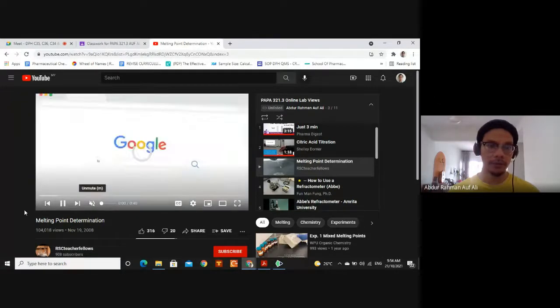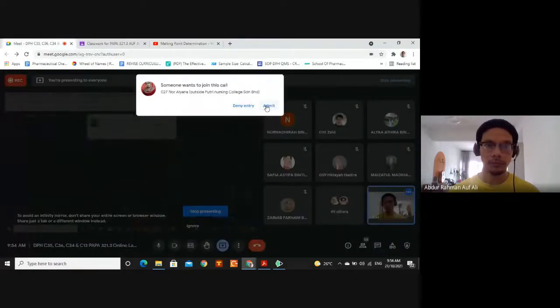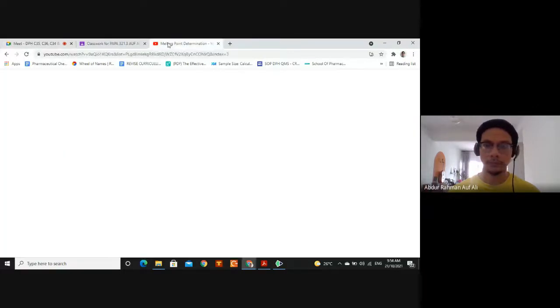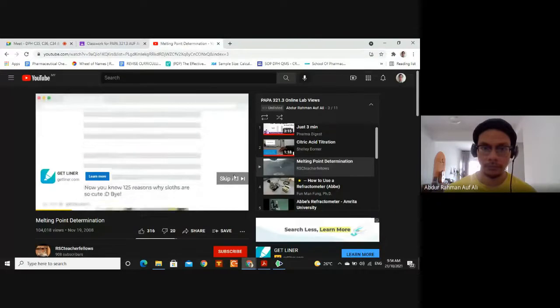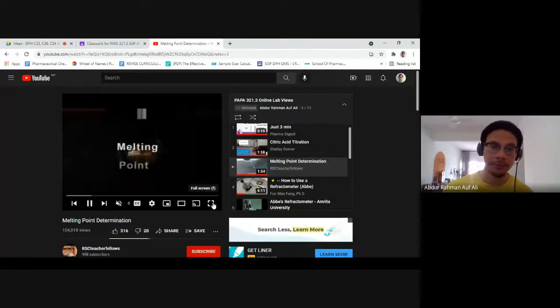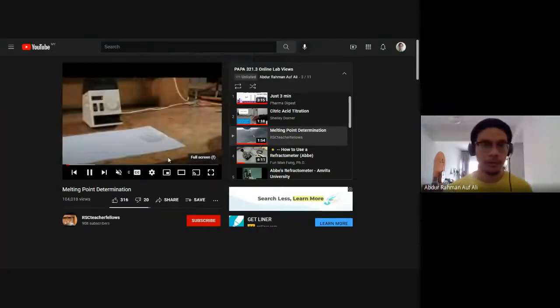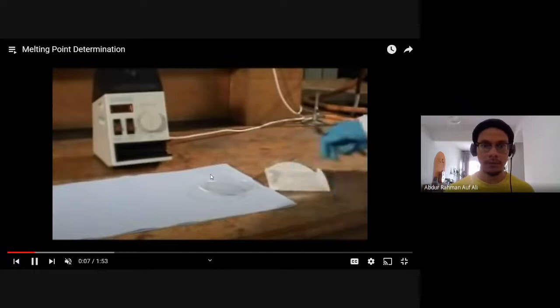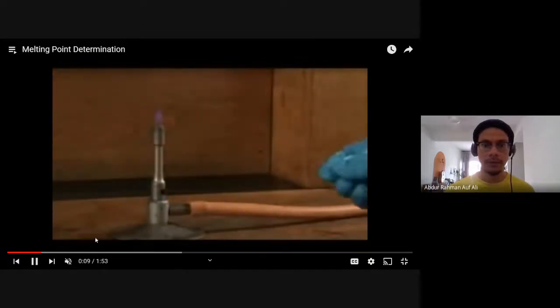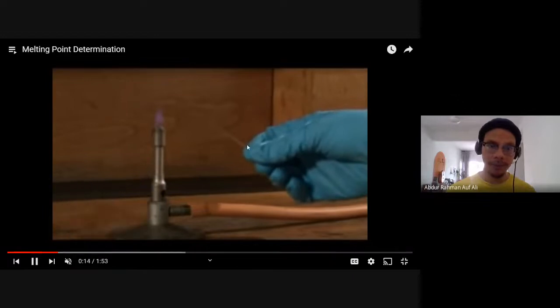This is an egg clamp. Okay, melting point determination. It's just a 1-minute video. So this is how they prepare the capillary tube. That is the capillary tube.